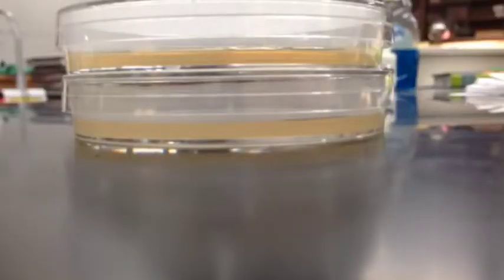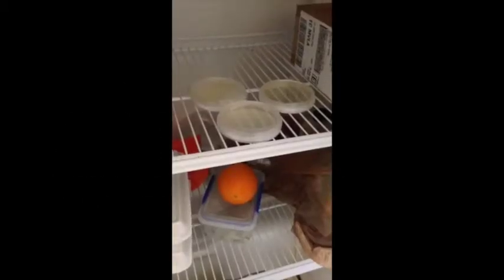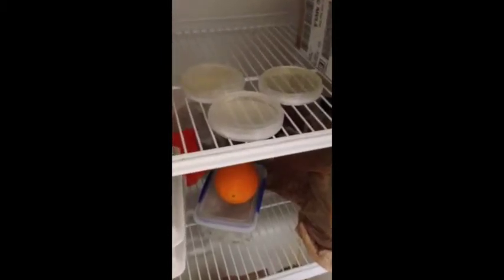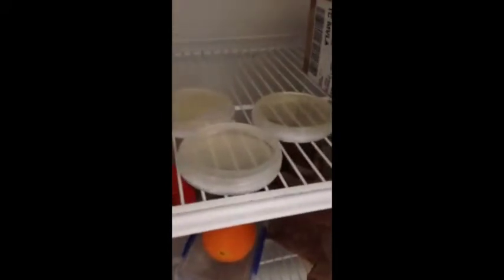Preparing the agar plates, you must make sure to keep the petri dish cover on. If you don't, airborne contaminants might get inside. Agar is a gel at room temperature at about 65 degrees. It melts at about 85 degrees. Agar gets hard at about 32 to 40 degrees, and that is why we set it in the fridge overnight. Depending on the agar, they will have different degrees of stiffnesses.